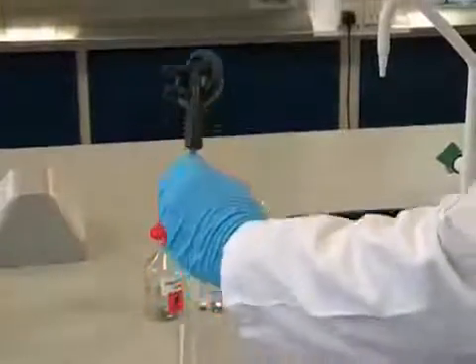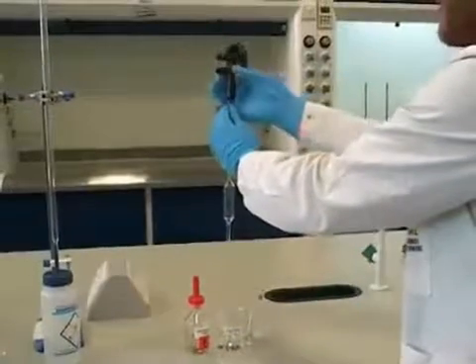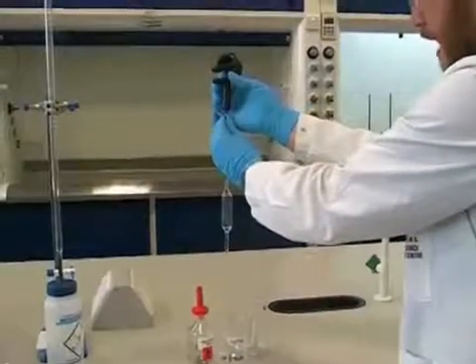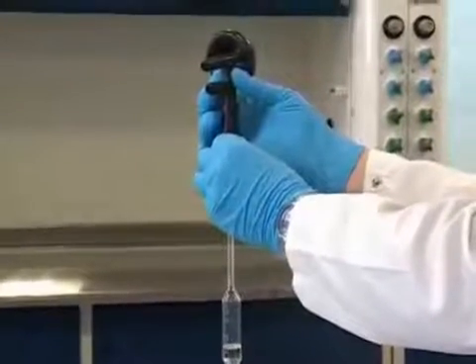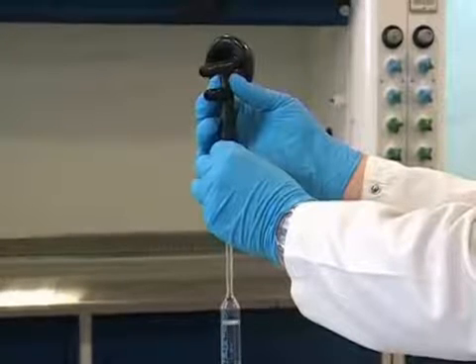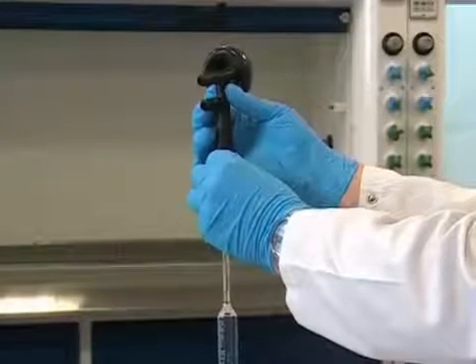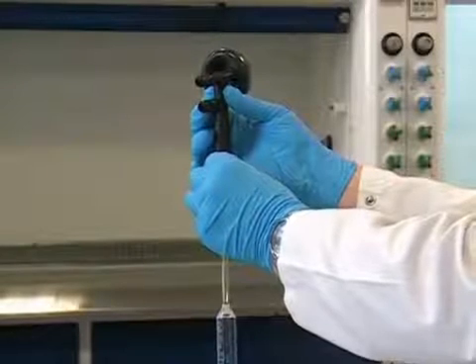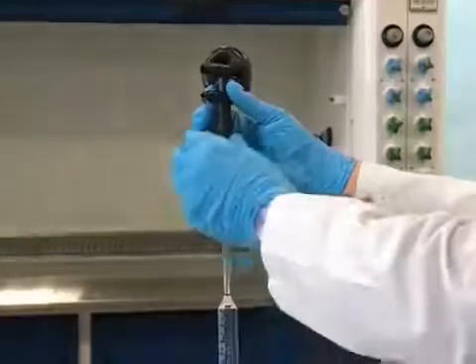And we're now able to draw up some of our solution into the pipette. We place the pipette into the solution and we press the appropriate button on the filler, and this draws the solution into the pipette. Initially we're going to take more solution than we need. Here you can see the line on the pipette and you can see the solution is clearly above that.